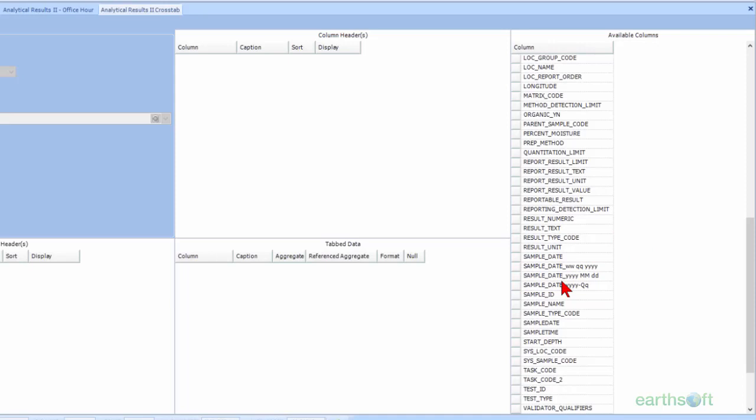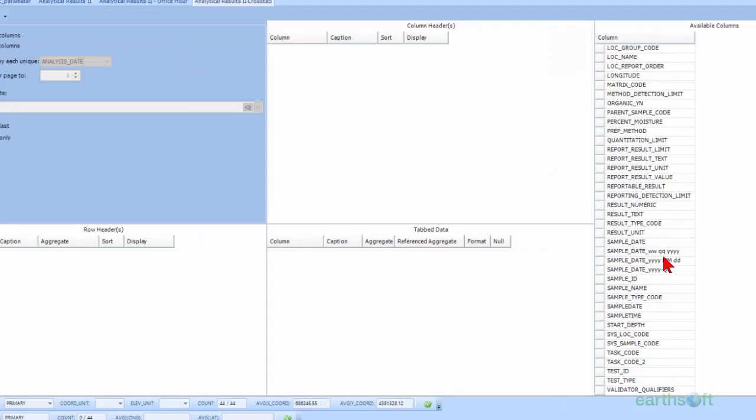That's not necessarily true of all of the other functionalities we're going to talk about, but that is one nice handy thing. You can throw the quarter separator in if you want to do a group by, for example, in your crosstab, and it will absolutely honor that regardless of whether that information is included in your source report the next time you apply that crosstab.